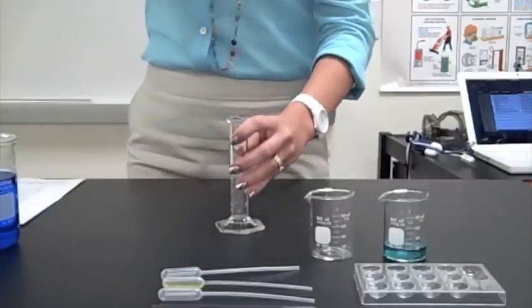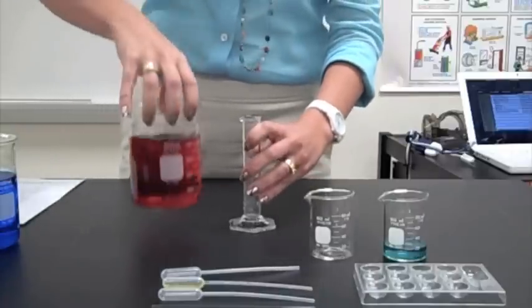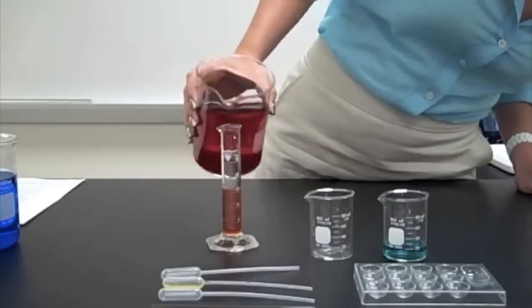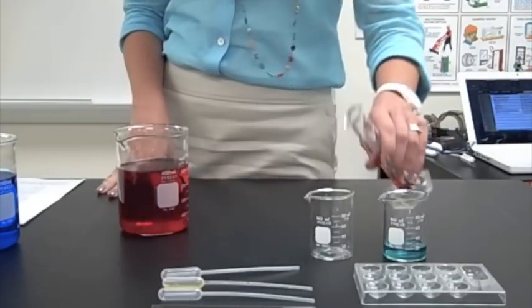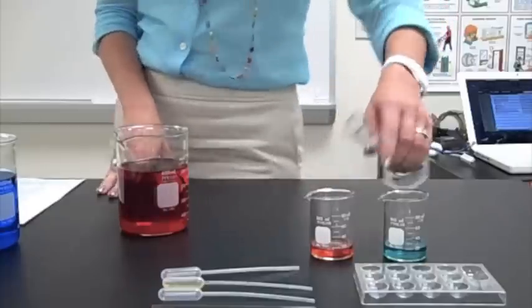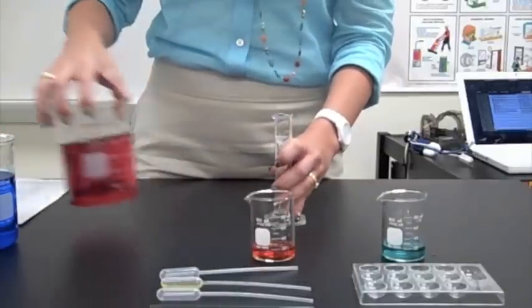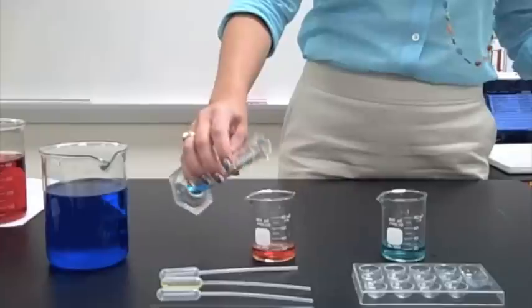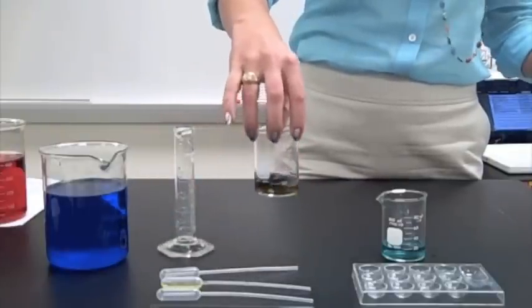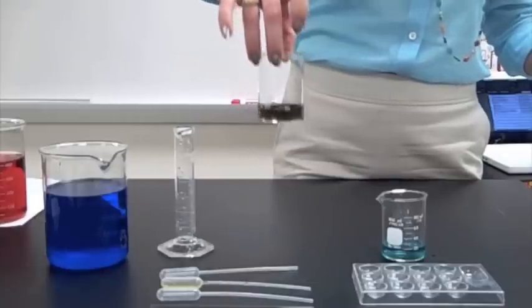Rinse it out again, which is what I just did, and 16 mils of the red solution. Here's our red solution. I'm going to get 16 milliliters. Pour it into the beaker. And now we've got to rinse our graduated cylinder again. Next step says, 4 milliliters of the blue solution. Add that to the red. Swirl it around to see what you get.